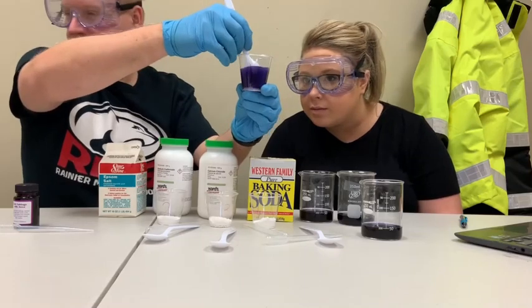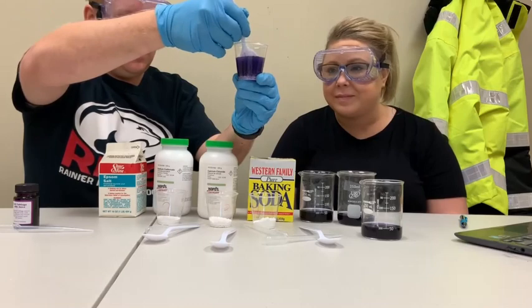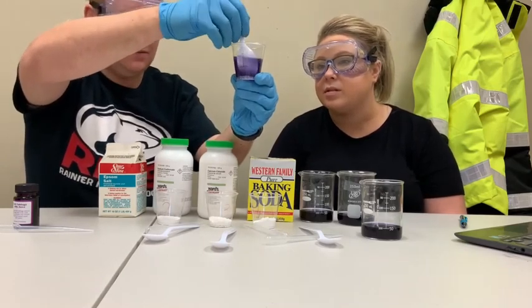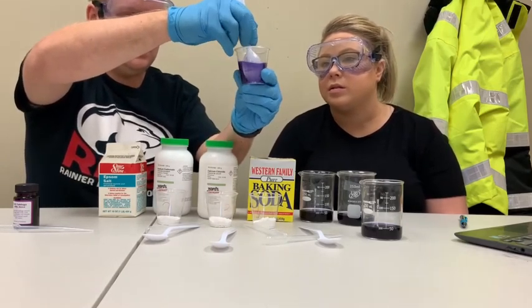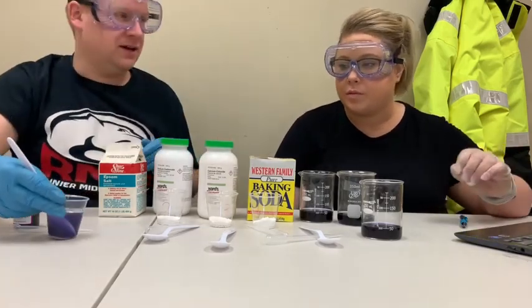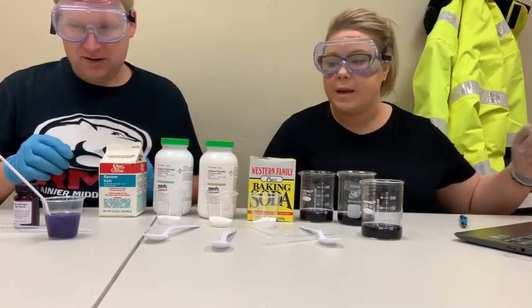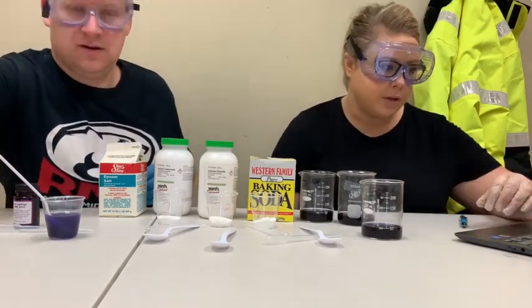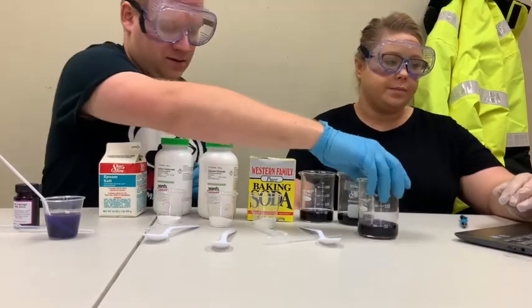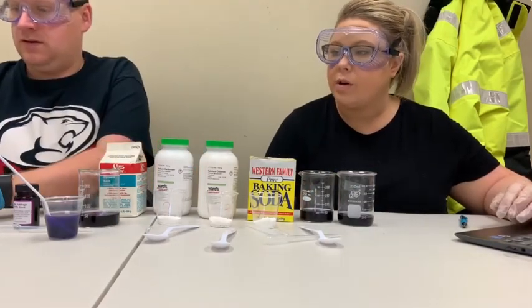No. It looks like some of our magnesium sulfate is still on the bottom, but it's definitely getting colder. So we'll leave this one right here and we'll go on to the next one. Okay, step 3 says perform the same procedure for the remaining powders. So we're going to do this for each one and record in our data table.